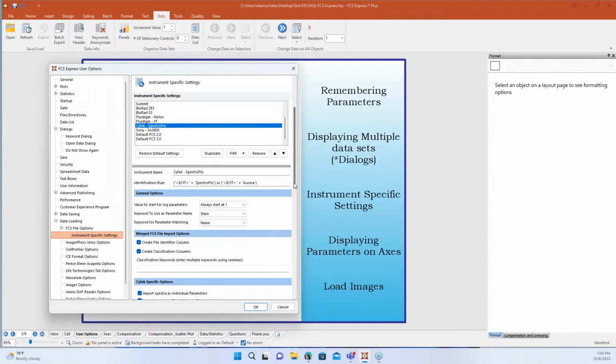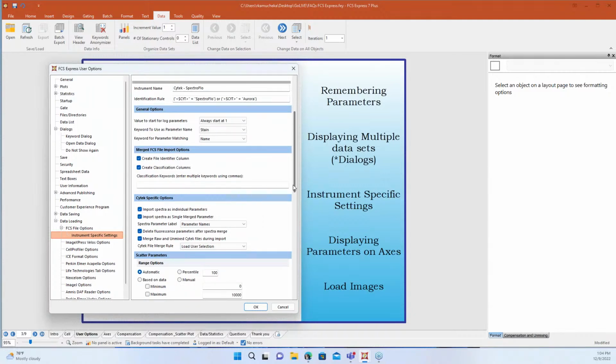One that I'm constantly responding to in support is that by default, we have this box checked to delete fluorescent parameters after spectral merge. This is designed for the fact that a lot of people are unmixing on the instrument, so we didn't want you to have to manage extra parameters that you may not be interested in. If you have this box unchecked, you would see those unmixed parameters, and you would see all the other channels as well. When you're working with raw data, however, you only get your scatter parameters. That can be a little terrifying at first, but if you come in here and just uncheck this box, those parameters won't be deleted, and you'll be able to see all of your channels from the instrument.